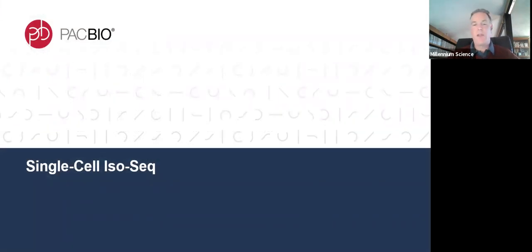And just to finish off, it's really a specialist application of ISO-SEQ, but people are now running single cell ISO-SEQ.